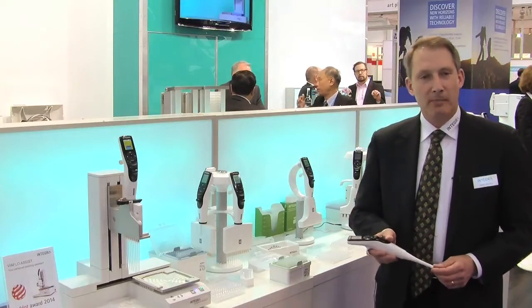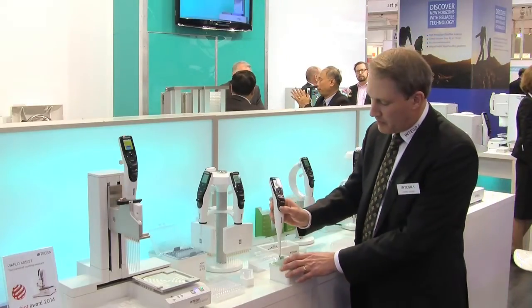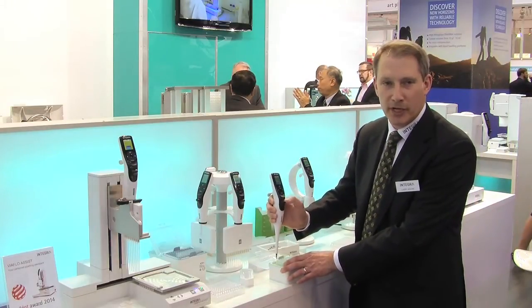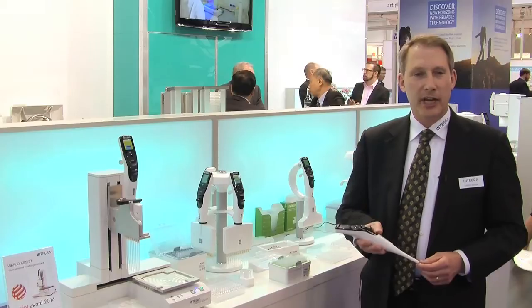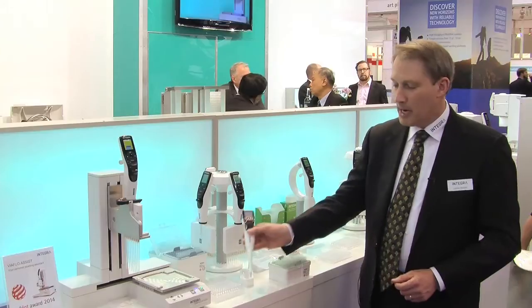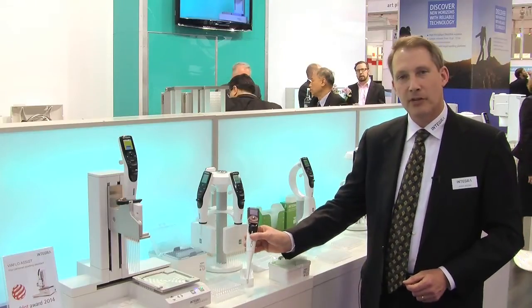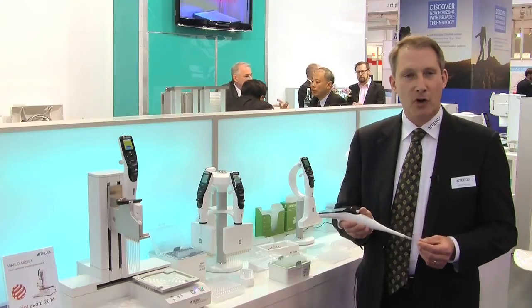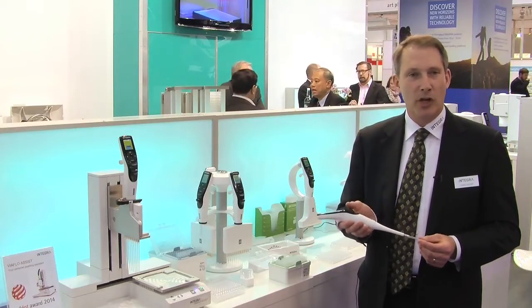When we designed all of these units, ergonomics was number one in our mind, and the first thing that we talk about is how we put the tip on. Many people when they pipette in the laboratory — in fact most — put on tips and they tend to bang the tips into the rack. With the Integra system we don't have to do that. We have a click, and when we come out we have a tip that is firmly ensconced in place so that you never have a tip that falls off or leaks while you're doing your work.